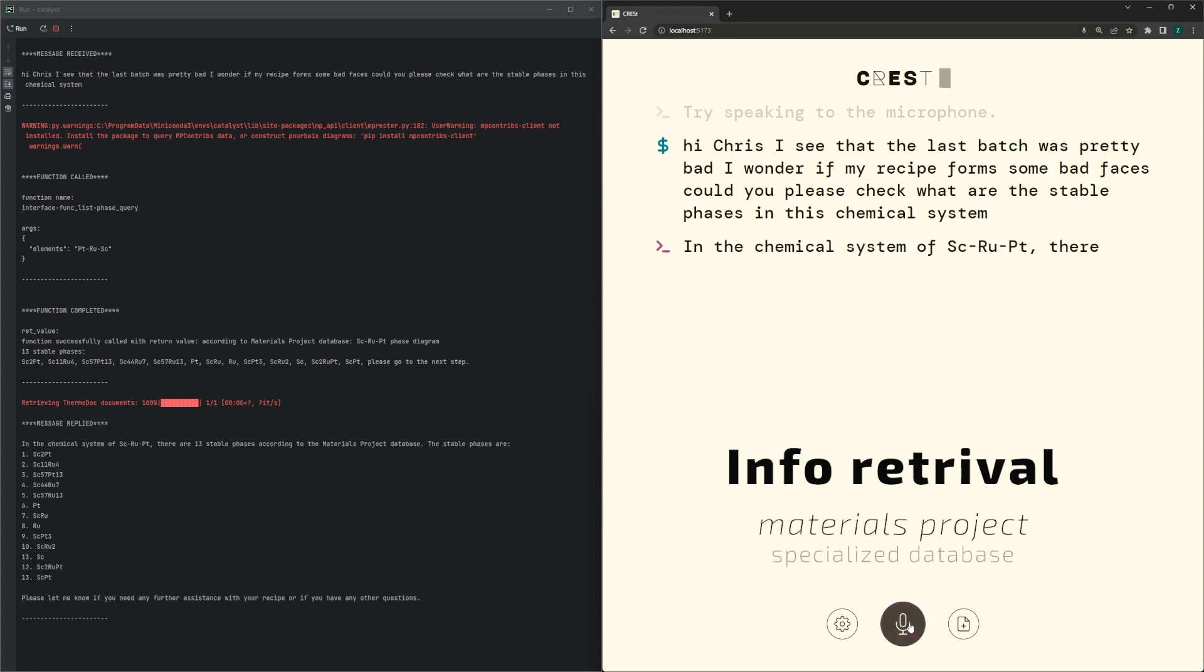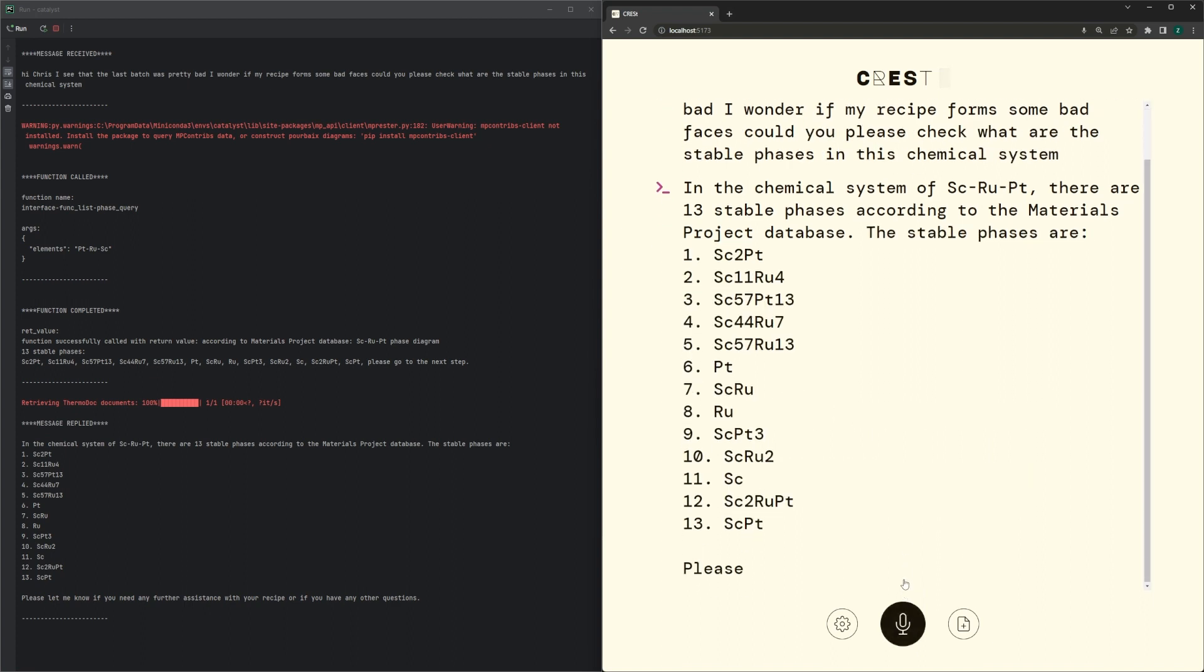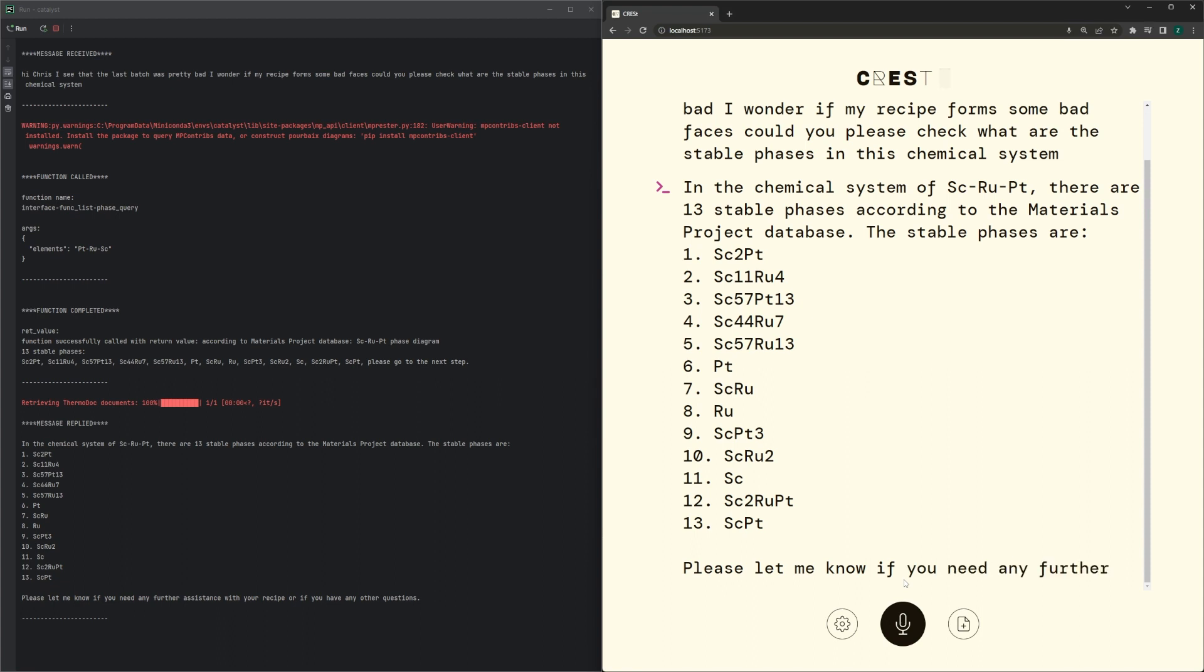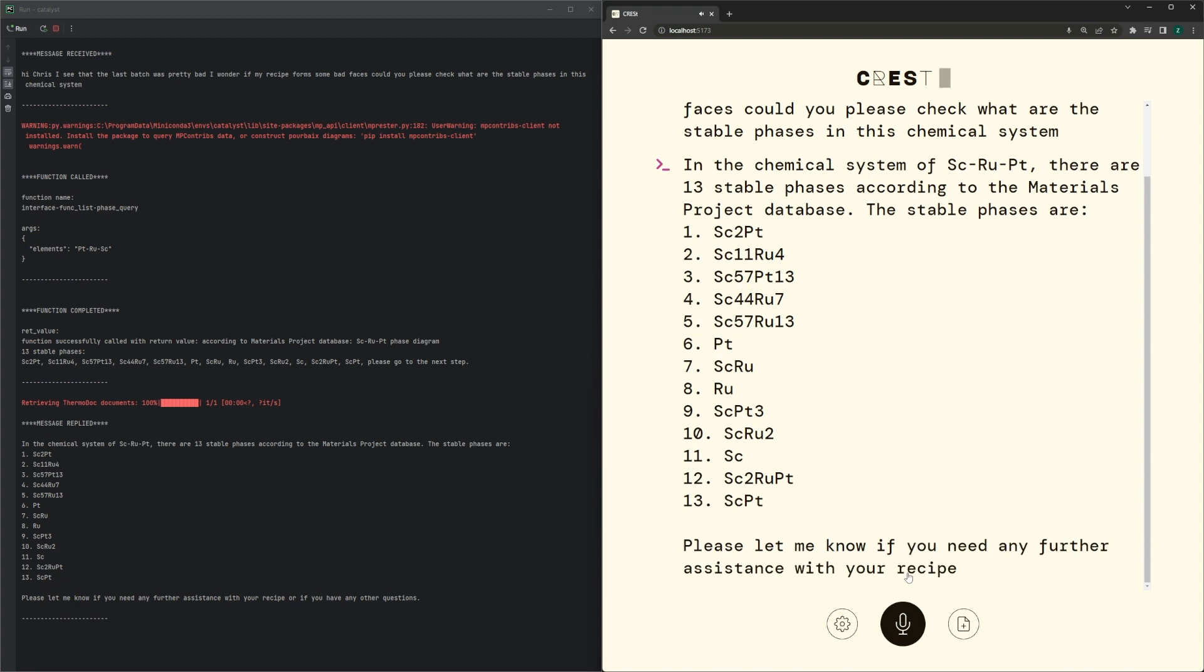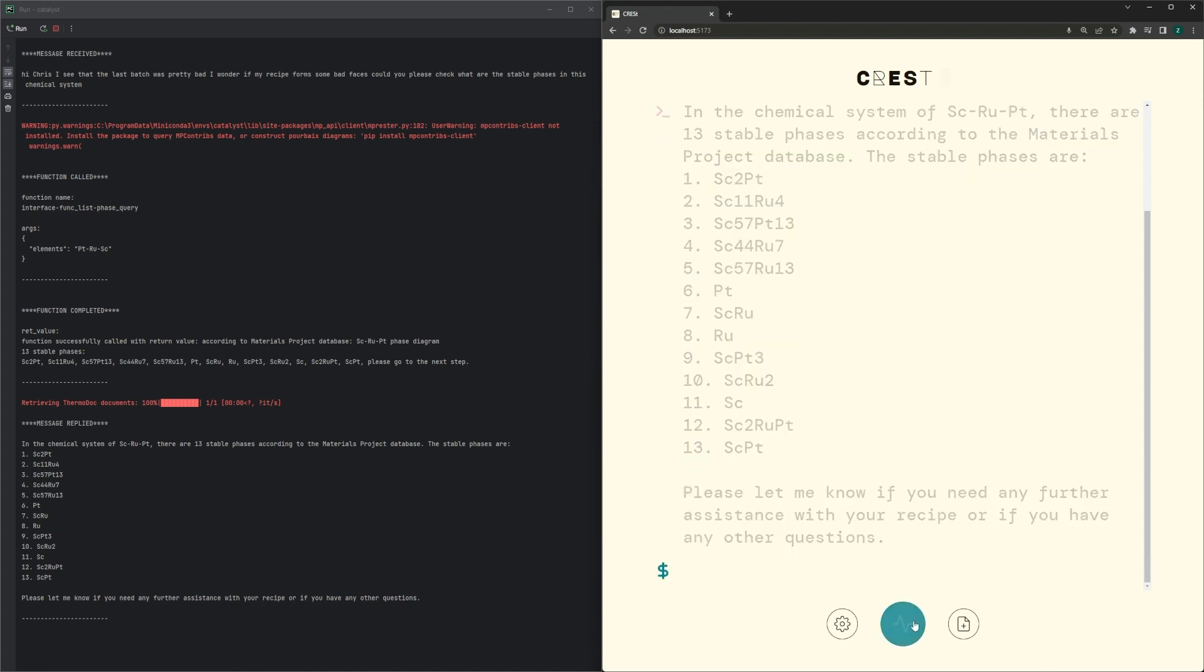In the chemical system of scandium, ruthenium, platinum, there are 13 stable phases according to the materials project database. The stable phases are: one, Scandium 2 Platinum; two, Scandium 11 Ruthenium 4; three, Scandium 57... Alright, that's enough. Please just select 3 recipes for me.